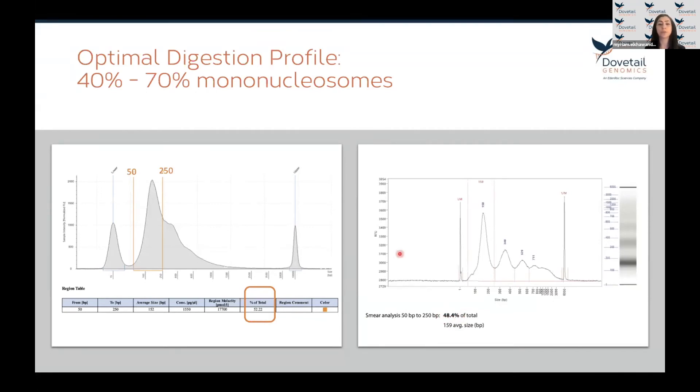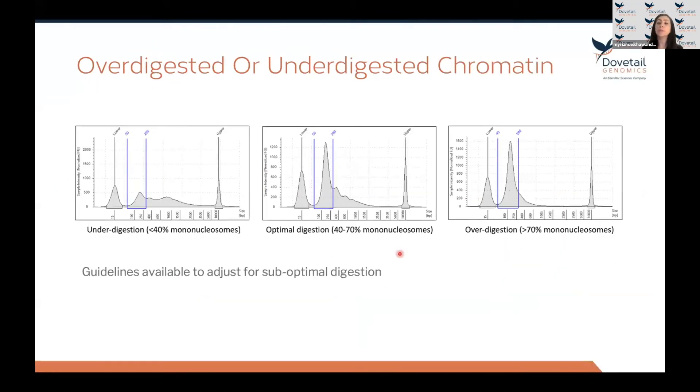If you have a suboptimal digestion, we provide guidelines to help you adjust. If the chromatin is under-digested, the mononucleosomes will be less than 40 percent. If the chromatin is over-digested, the mononucleosomes will be more than 70 percent.